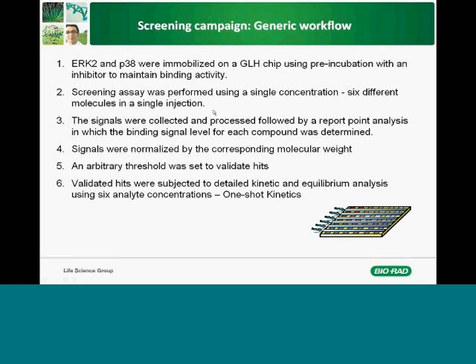So we screened them, and the point in screening is that you have lots of molecules, so you're not performing a full kinetic assay, but just a screening assay. So each compound is injected at one concentration, and the signals generated are then collected and measured, doing a report on analysis that is done by the software of the ProteOn.